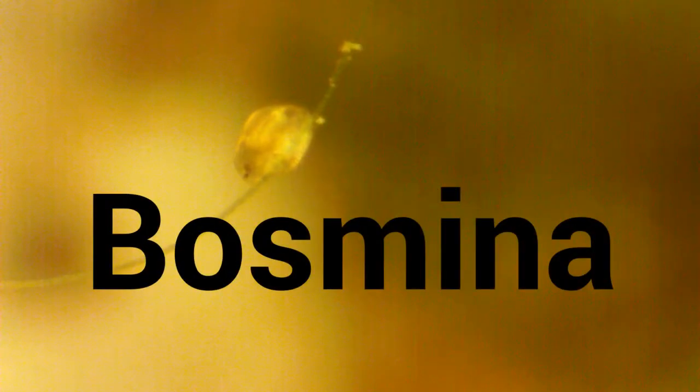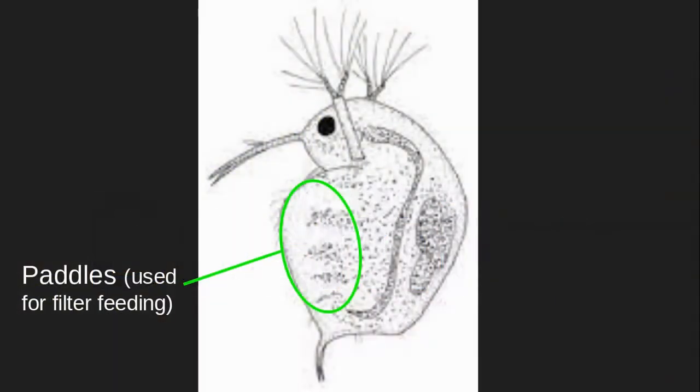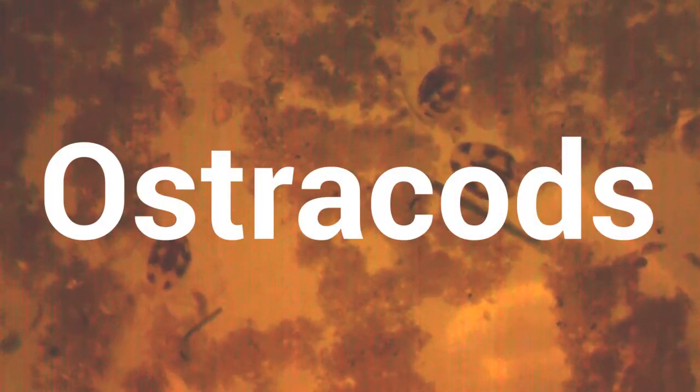But copepods aren't the only common crustaceans we see in the river. We also have a genus of water flea, Bosmina. Like all water fleas, it filter feeds using paddles on its underbelly, scooping up floating algae, bacteria, and edible detritus. The final crustaceans we find here are ostracods. These microorganisms have a simple anatomy and simple diet, feeding primarily on algae.